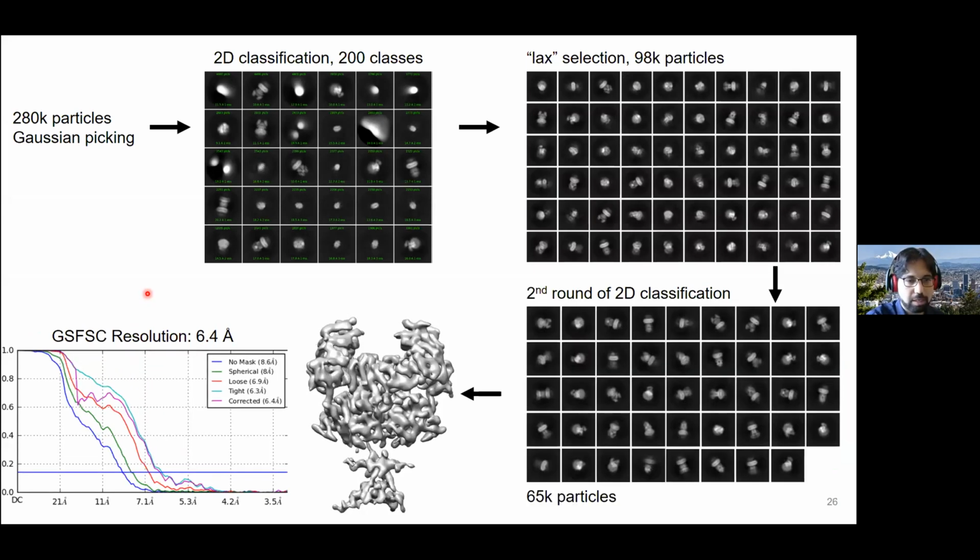Ideally the FSC would be very high, around 1, and then it would jump straight down at the limit of your resolution. But it usually has a slope, and when the bottom part of it is extended, you start looking at it and saying, maybe that's not quite real. There are FSC wars going on on the email lists. Feel free to attend them. They're fantastic.